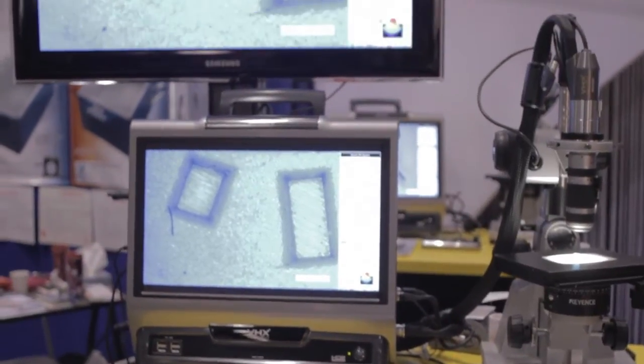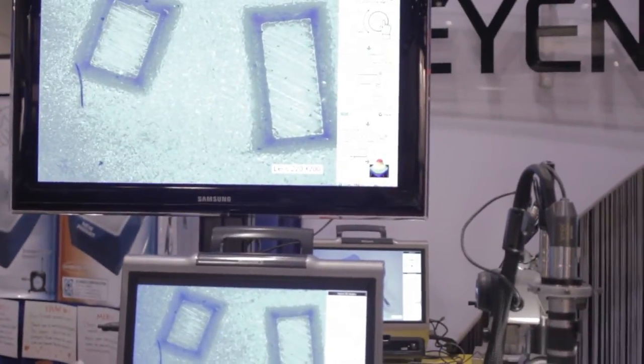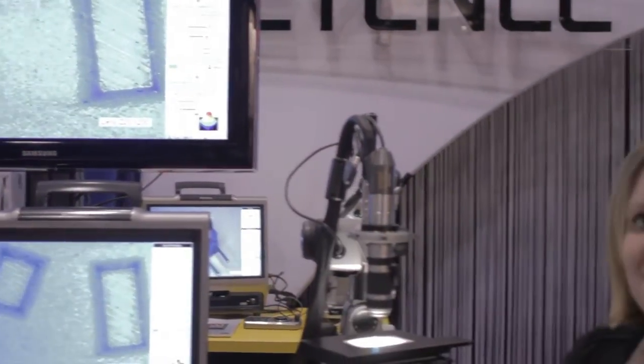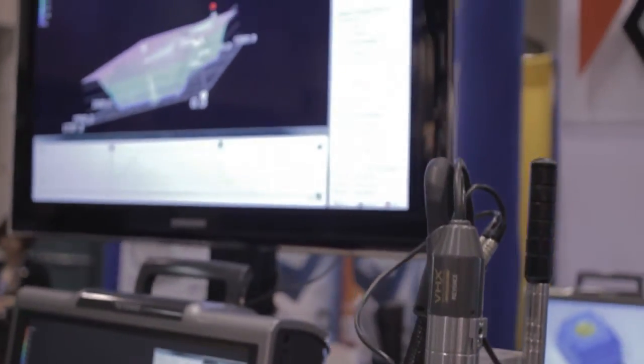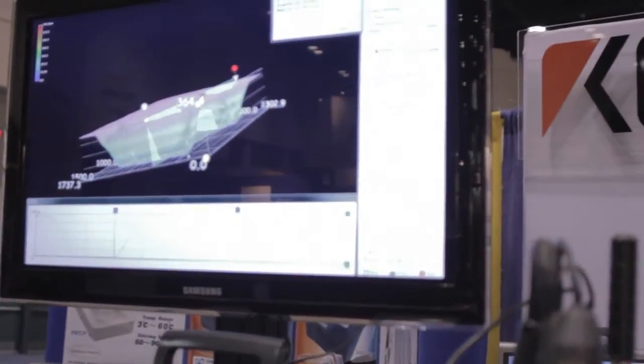Once you have the image you want, you pause the function, you could save this image, measure on it, comment on it, and it saves with any of those measurements or comments. But we can also take it a step further.